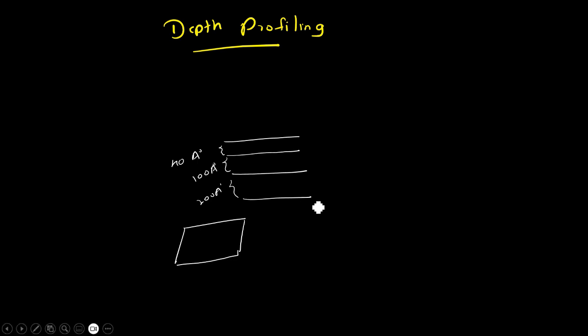Up to now, in the few videos we have discussed before, like XPS and AES, we all focused on the surface, but in this case we are focusing more on the inside of our material. The principle is that we are going to do the same AES process.